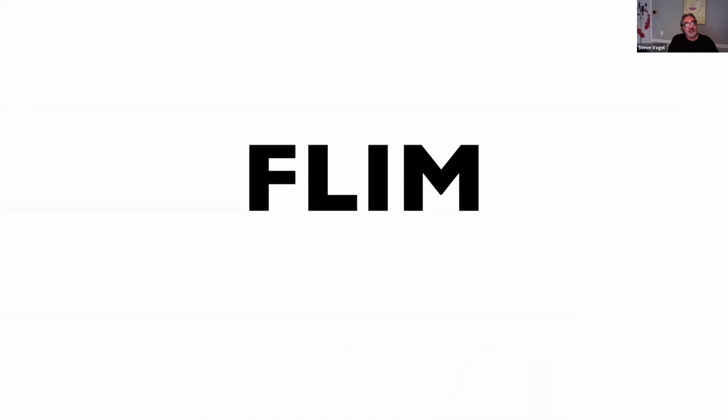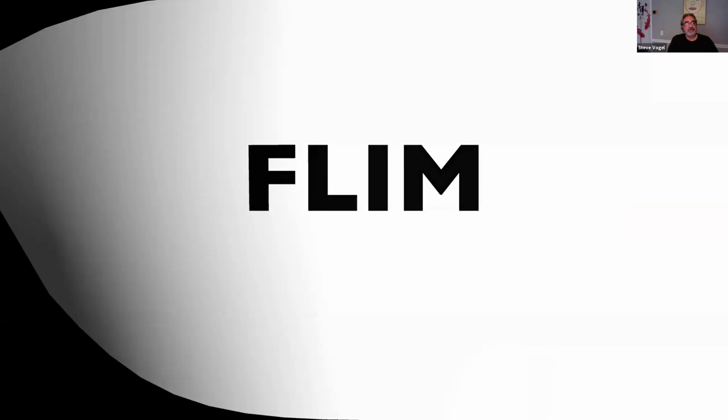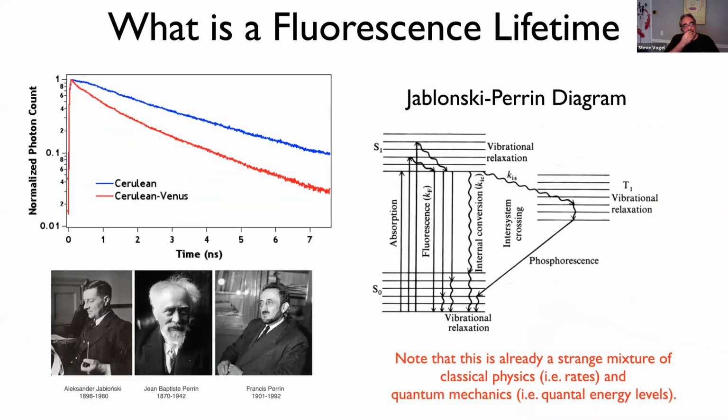Okay, so let's talk a little bit about FLIM, fluorescence lifetime imaging. In the upper left corner here, I show you some of our old data from when we first started doing FLIM, maybe 17 or 18 years ago now. And we were using it for FRET, and we're going to get to that in a second. The blue curve is a lifetime decay curve of cerulean, a blue fluorescent protein. And the red one is a cerulean that's been ligated to a Venus, a yellow one, that's undergoing FRET.